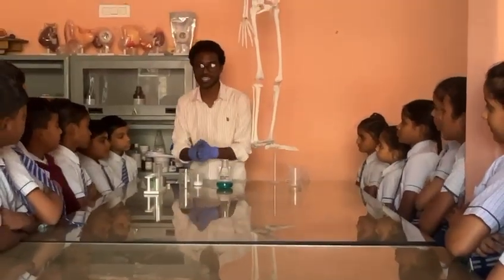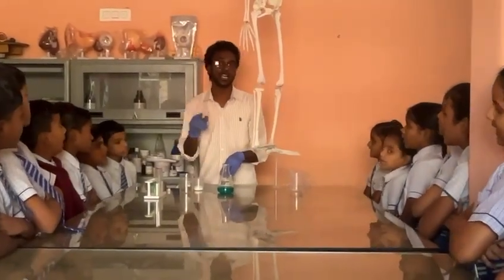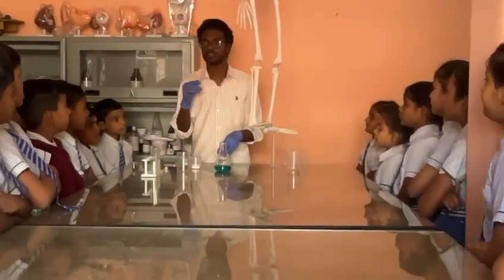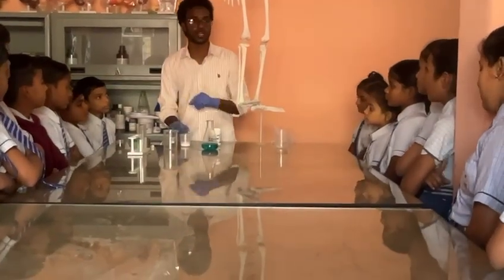CuSO4 plus NaCl gives CuCl2. Copper chloride. After adding sodium chloride, it will become copper chloride.